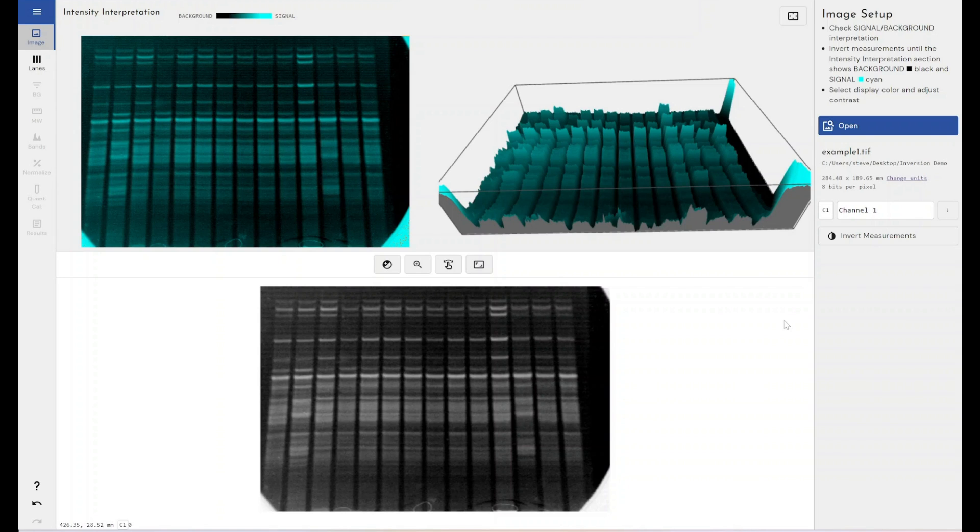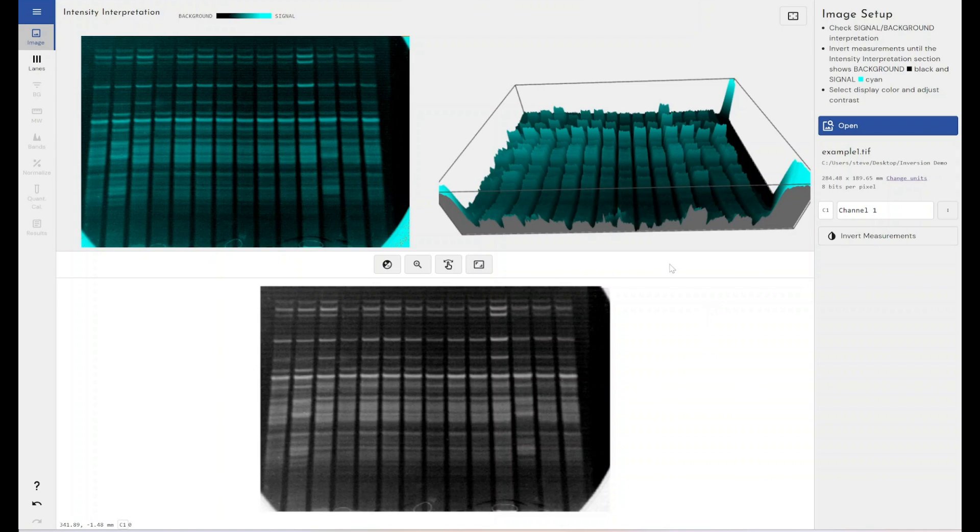If I wanted to make that match up to what I saw on the scanner when I imaged my membrane or my gel, I would say to myself, well, that's not what my image looked like. I had white bands on a black background. This is wrong. Actually, this is correct. This is the way the data should be handled. It's just not looking the way you expect it to look.